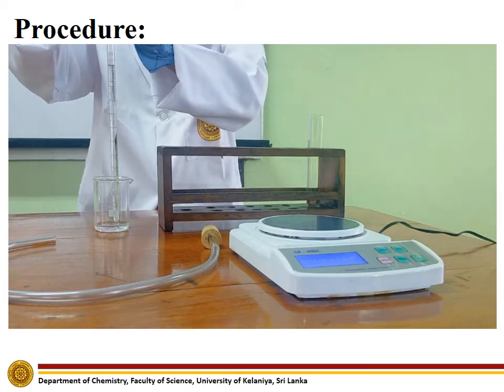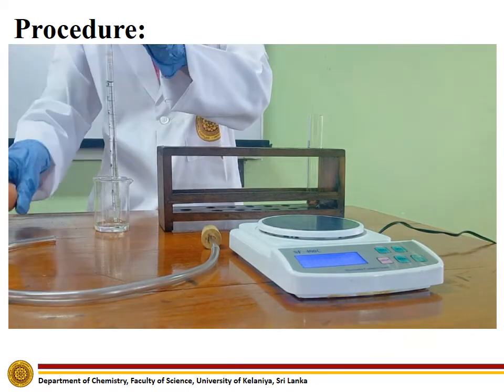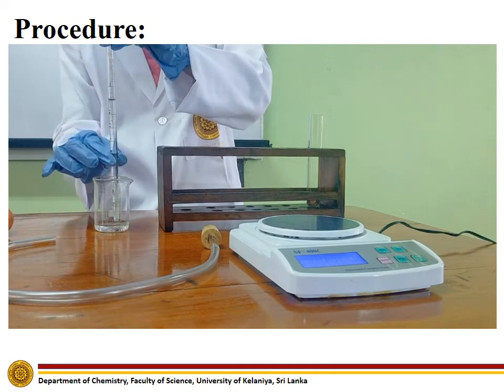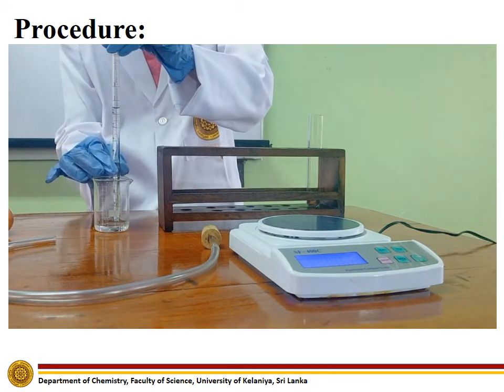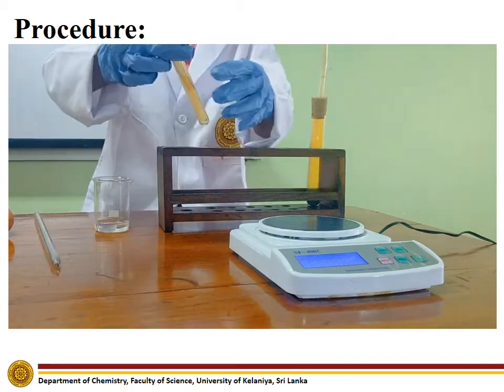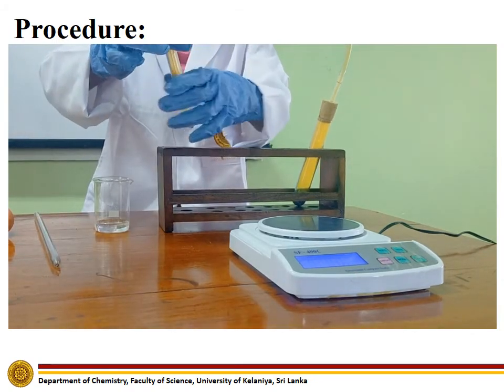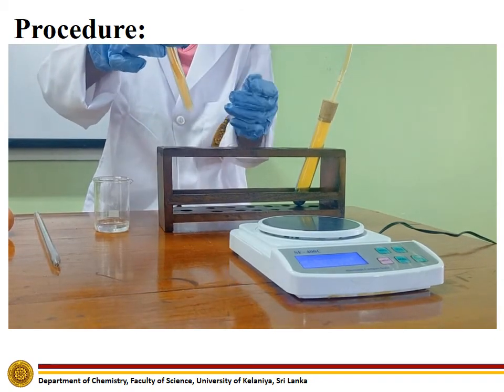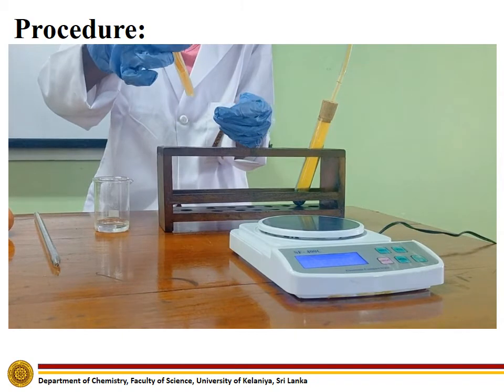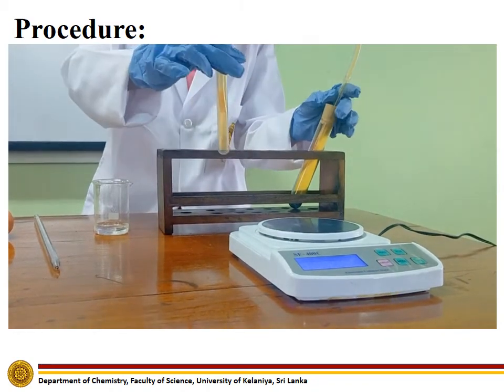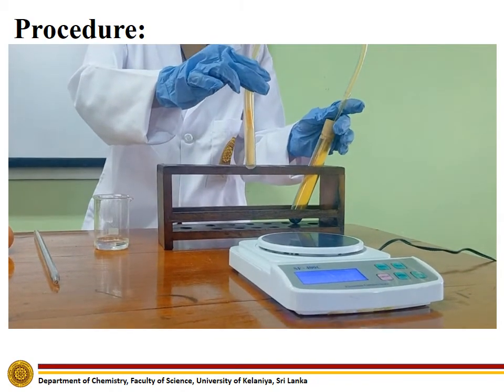After adding nitric acid, connect the delivery tube immediately. Collect the evolved gas into 3 identical test tubes so that the glass tubes get the same color intensity.